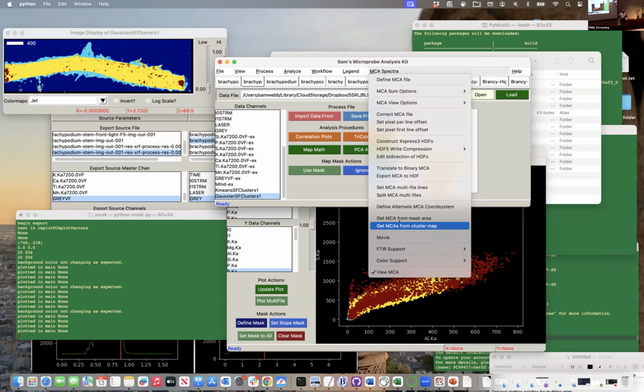Again, how can we do these correlations, do clustering, and then look at what the raw data looks like, not just the bin data? So that's a nice, really powerful tool to bring that together.